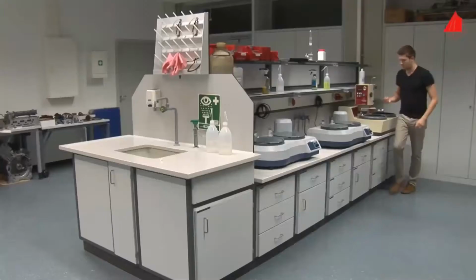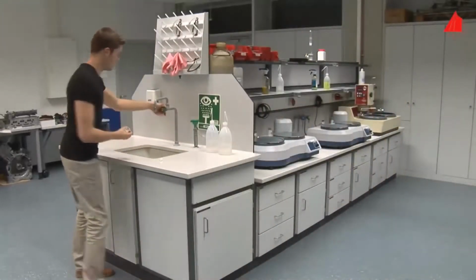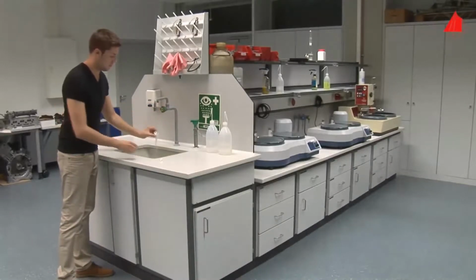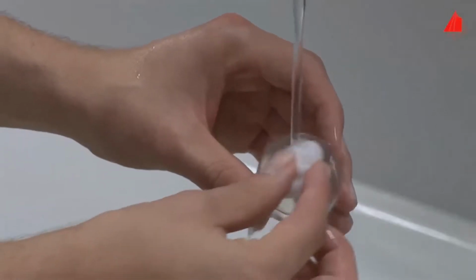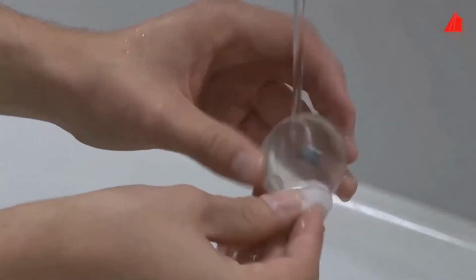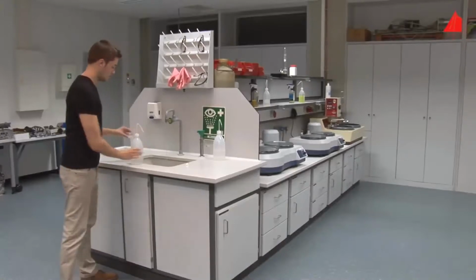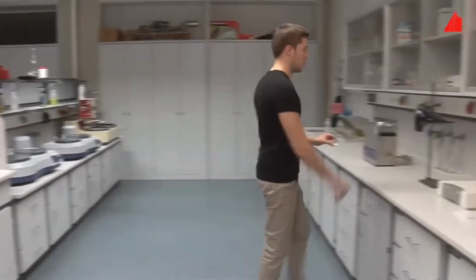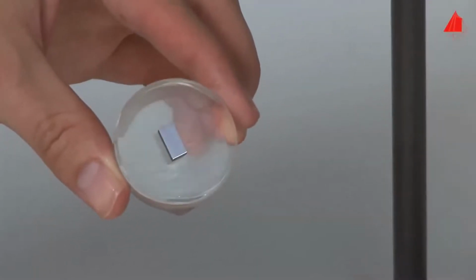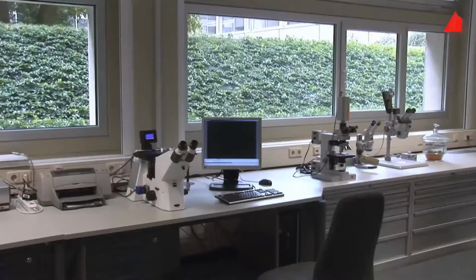At the end of the mechanical preparation, special care has to be taken to clean the specimen properly. On the one hand, all abrasive particles have to be removed. On the other hand, the freshly polished surface must not be scratched or damaged. Under running water, the material tester gently wipes the specimen with cotton wool, thoroughly rinses it with alcohol, and dries it with a hairdryer. From now on, the sample is called a metallographic specimen or microsection. Judged with a naked eye, our metallographic specimen seems to be well prepared.